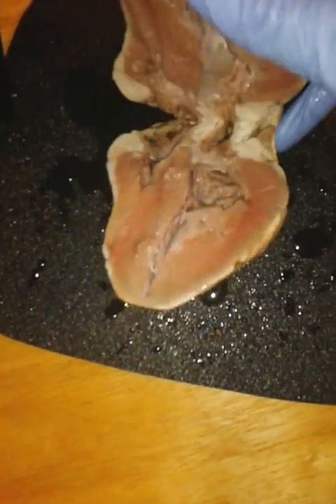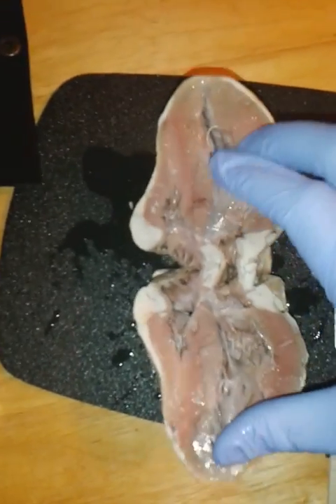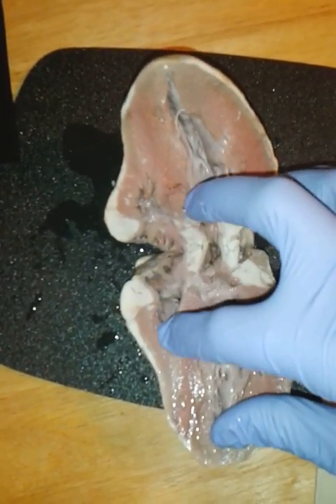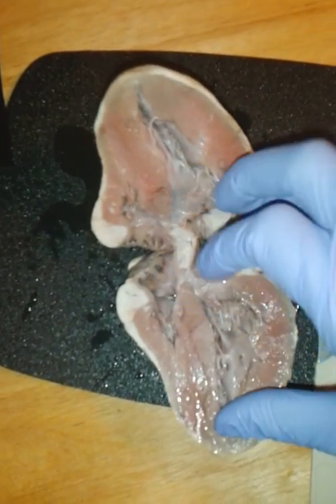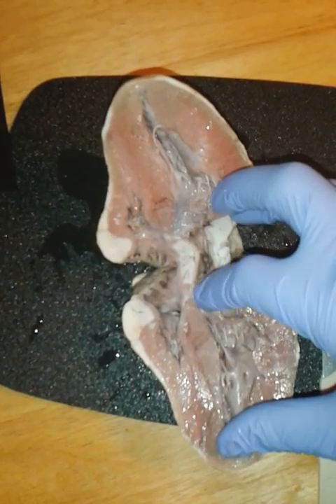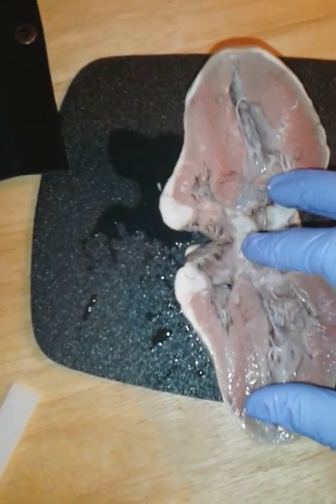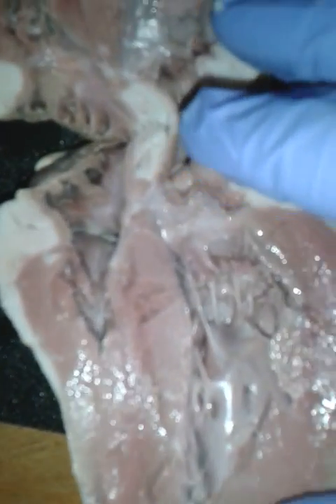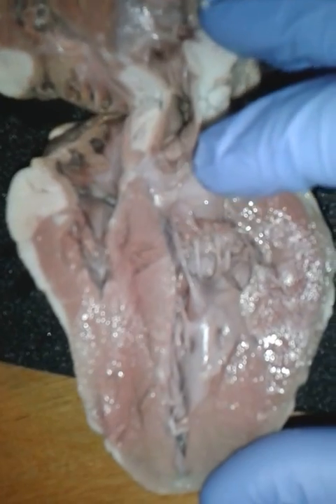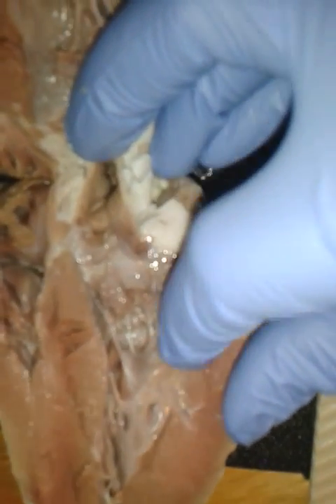As we look at the internal structures, we have again the right atria and the right ventricle, left atria and left ventricle. We'll look a little more closely so we can view the pectinate muscles of the inner wall right along here.